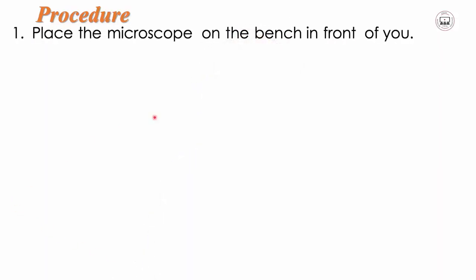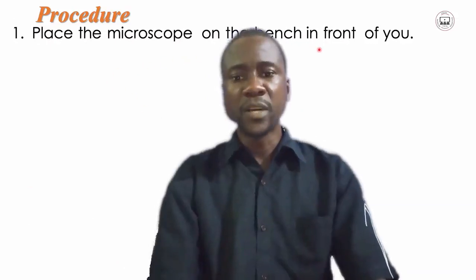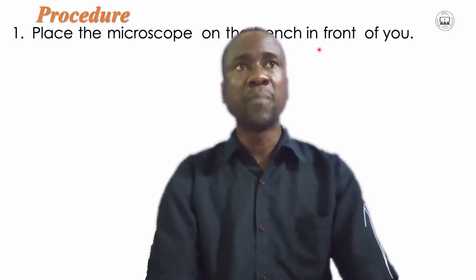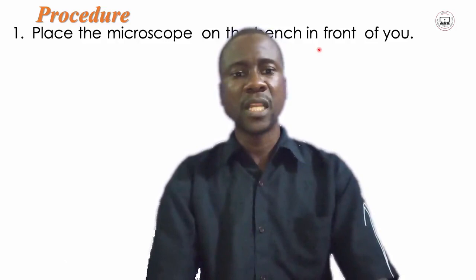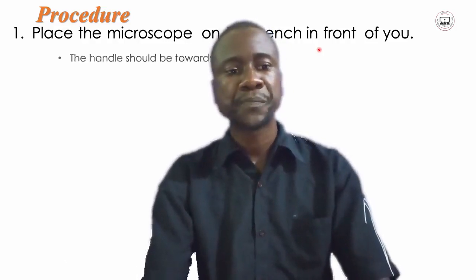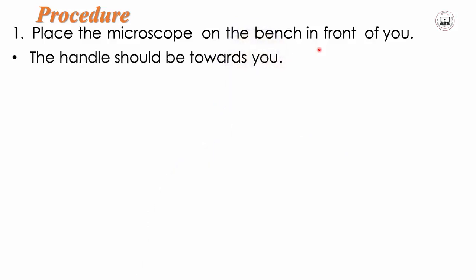One, you are supposed to place the microscope on the bench in front of you. In laboratories, most of the time, you may have benches. Place that microscope on the bench in front of you. Then the handle should be towards you.